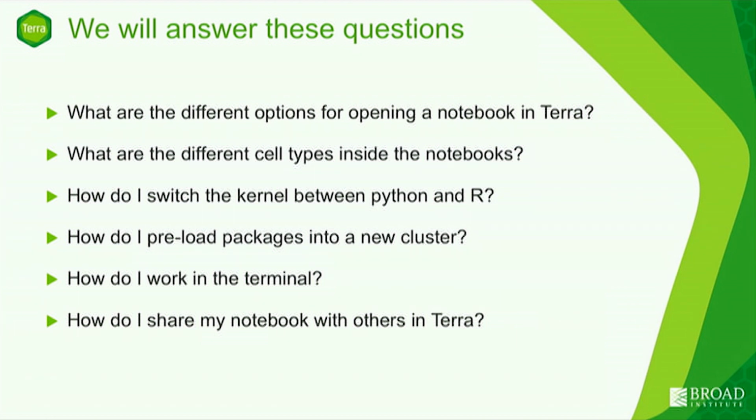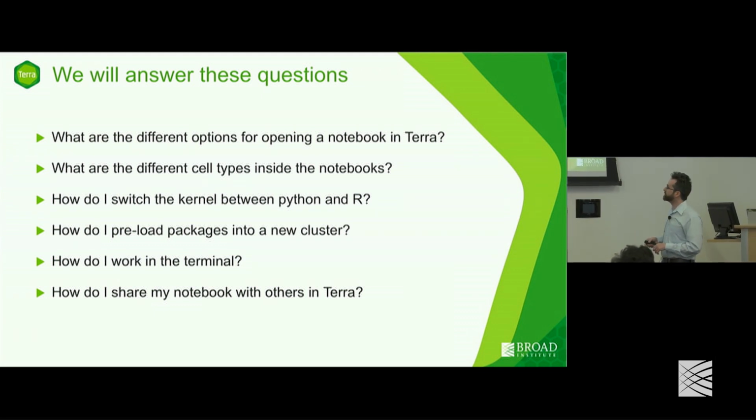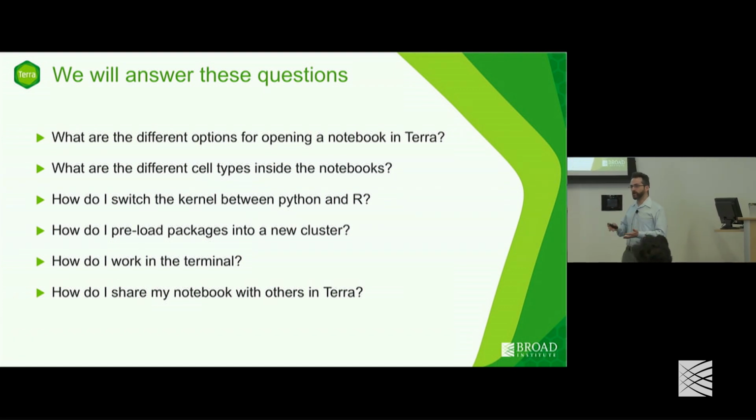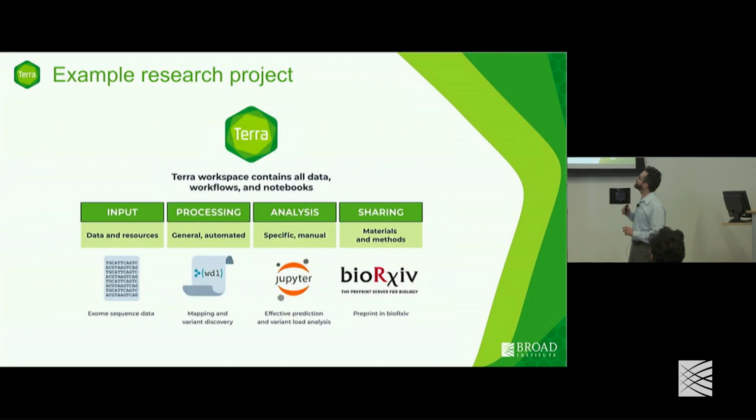You will understand how to control the type of kernel that you're running off of and which types of kernels are available, how to, for instance, work in a terminal through the Terra portal that actually accesses your cluster, and also how to share the notebooks and all the things that go along with that, since sharing is kind of one of the central aspects of what's so great about Terra.